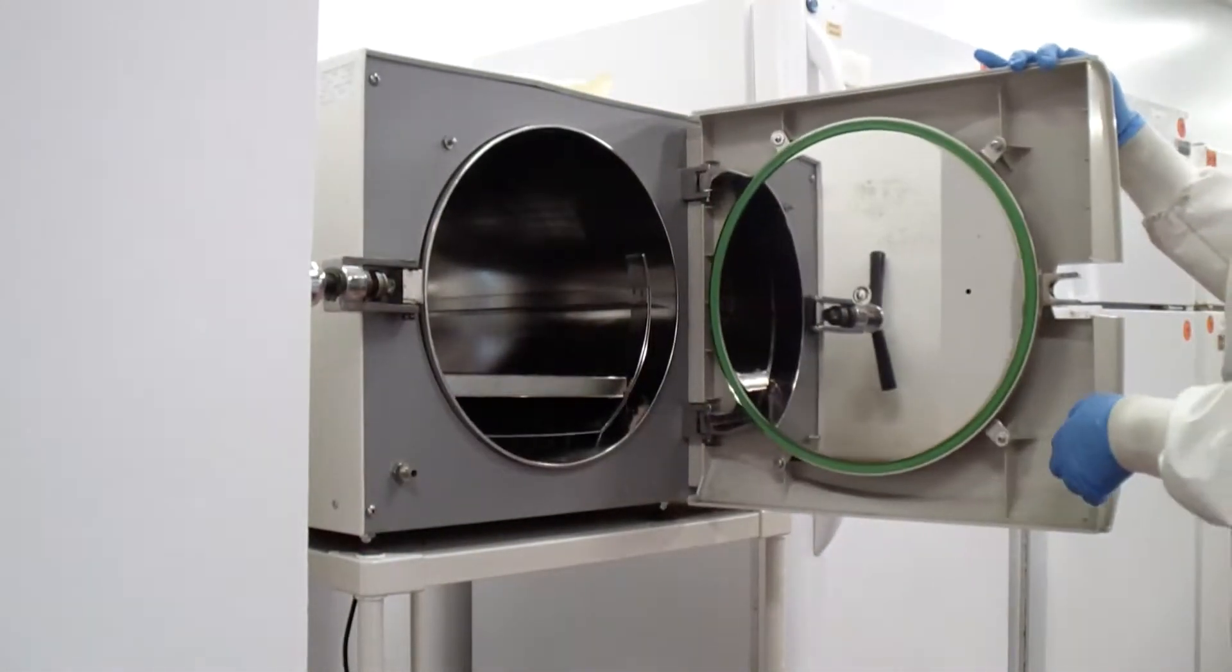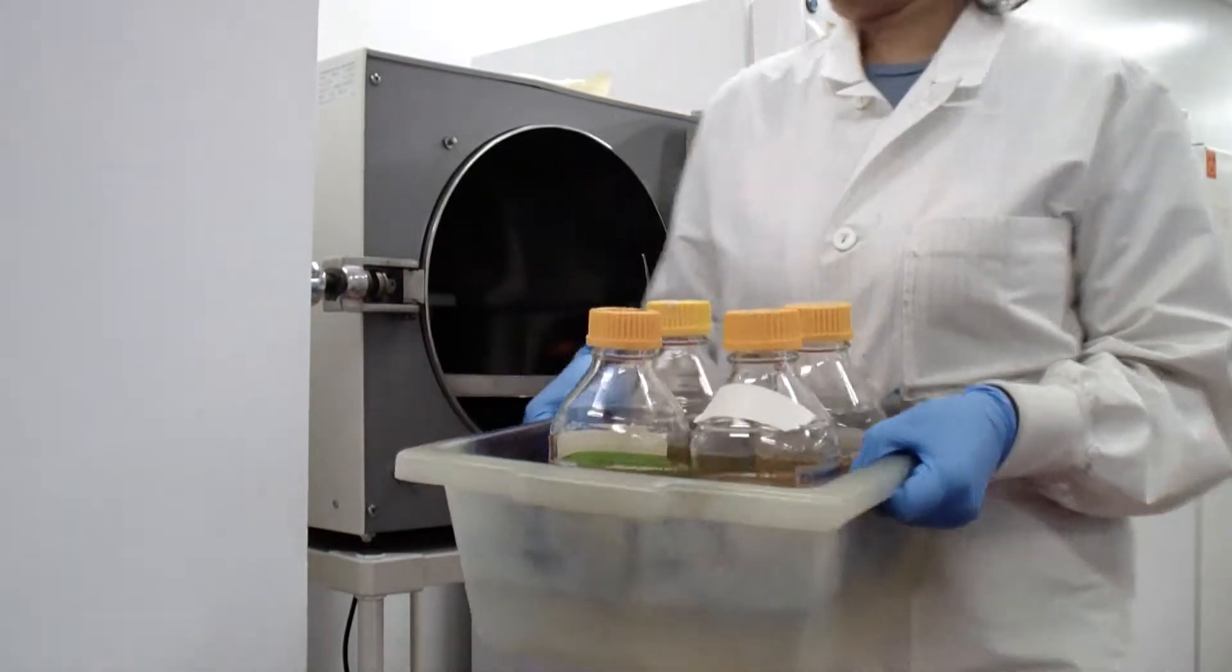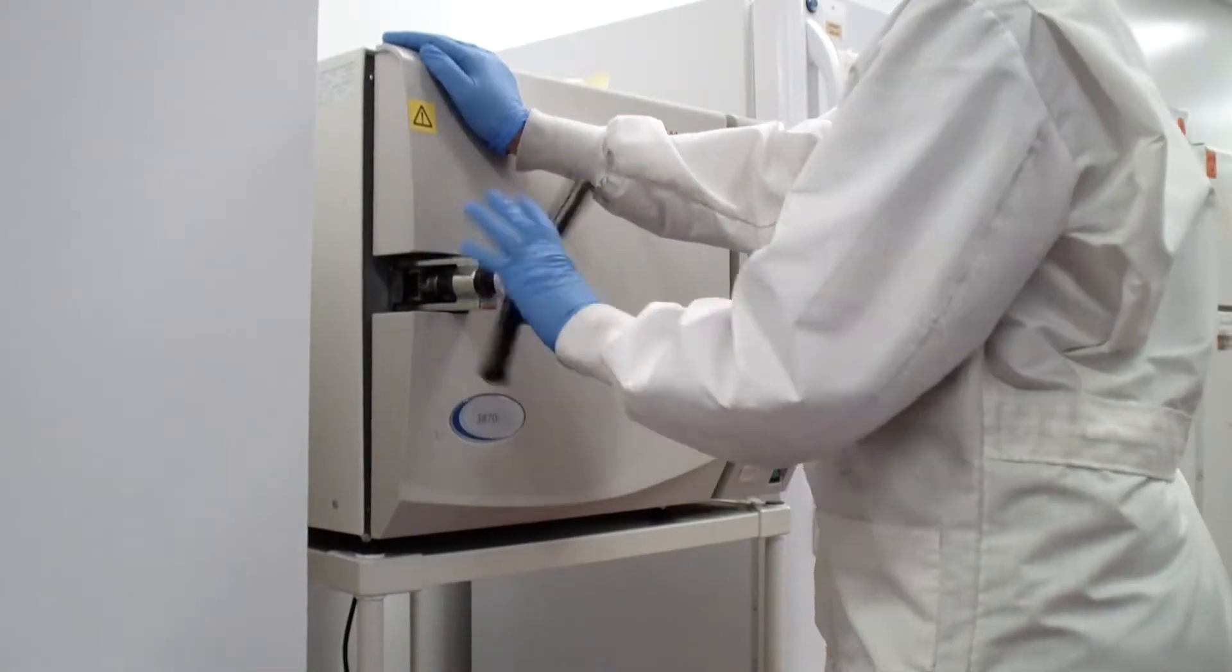An autoclave is a device that sterilizes media and tools by subjecting them to high heat under pressure. A container with some water and the bottles with medium is placed in the autoclave and the door is closed tightly so that the pressure can build up.